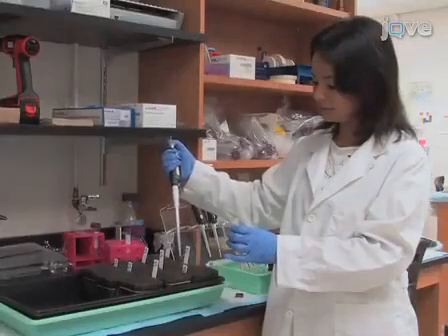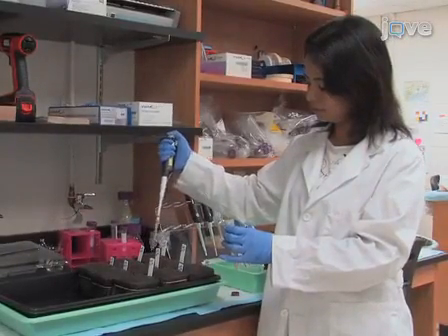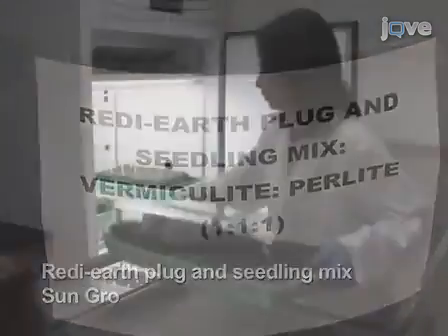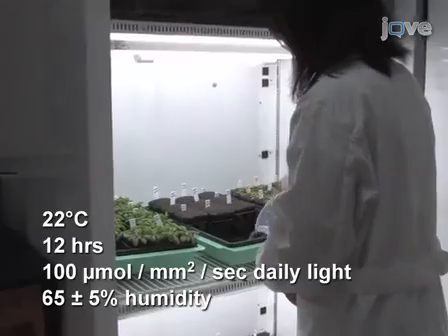To begin this procedure, sow Arabidopsis seeds on a 1:1:1 V/V/V mixture of growing medium, fine vermiculite and perlite. Grow the plants in a growth chamber and water as needed.